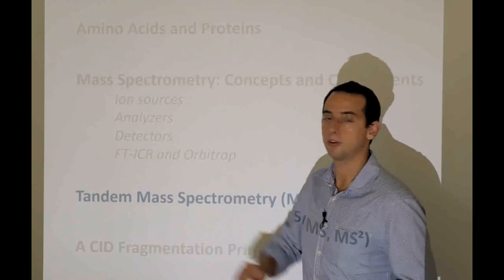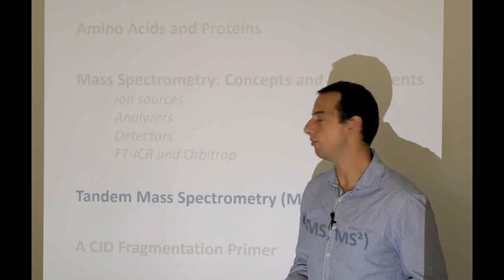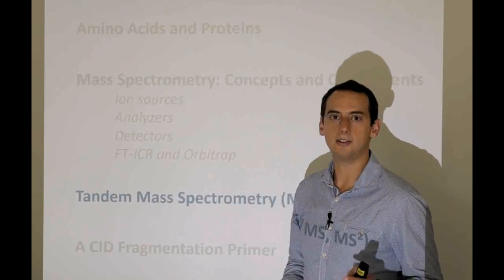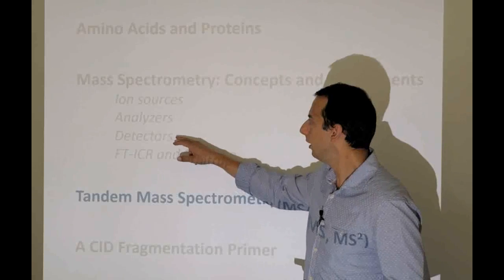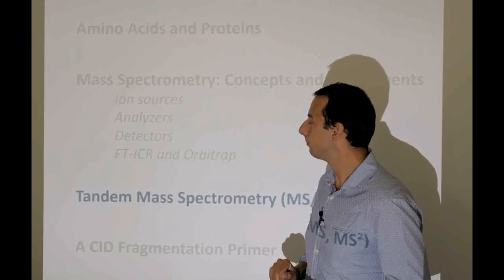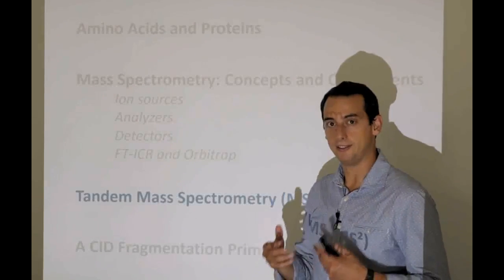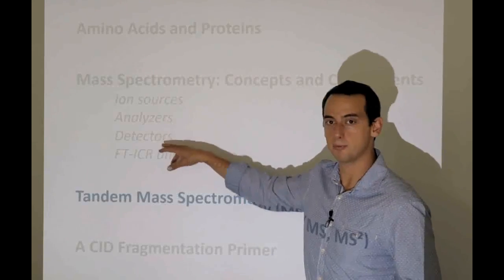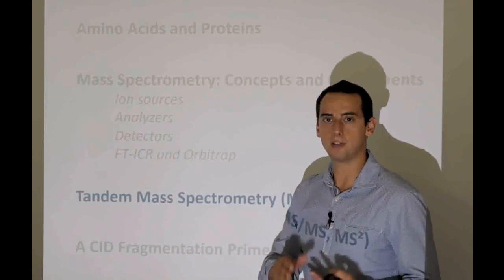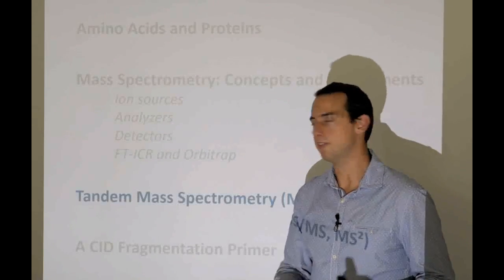In the third lecture, we talked about the mass analyzers that actually find out what the inertial mass is of a particular ion. And in fact, usually the analyzers give you mass over charge. Then the fourth lecture was about the detectors that finally detect the movement of the ions in the instruments, and they are an important part in making the mass spectrometry work, obviously. And they can also give us signals about the quantity of a particular ion that is there, with some caveats.